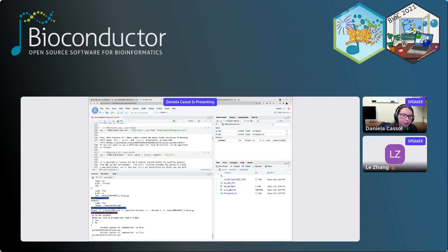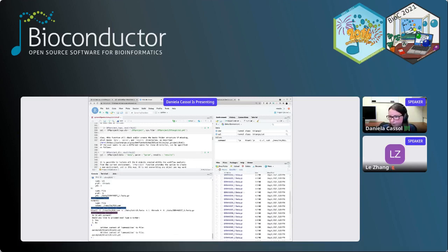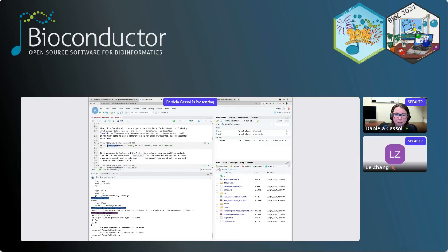And then I mentioned earlier the data. I haven't shown it, but if you click on data, you have all the FASTQ files. More than we actually need, we just select 4 to run, and you have the reference genome as well. Then here on param we have all the folders from CWL with all the tools we have available, and you can create and customize the tools you like. In the results folder, we'll put all the results, the SAM files we create in the workflow. That also helps keep the raw data organized and separate from the files from your workflow. SPR project also allows you to give other names, so if you don't like those names, you can name those folders in a different way.